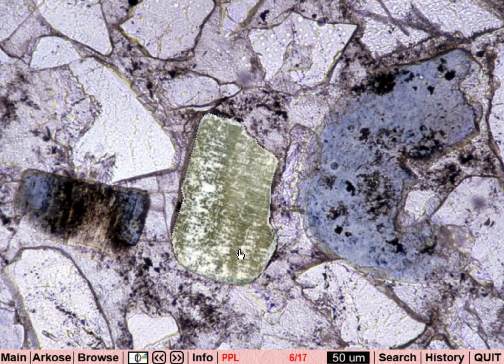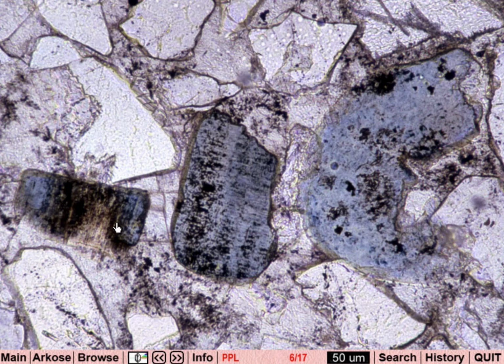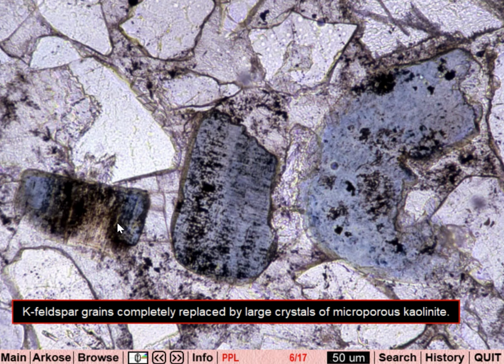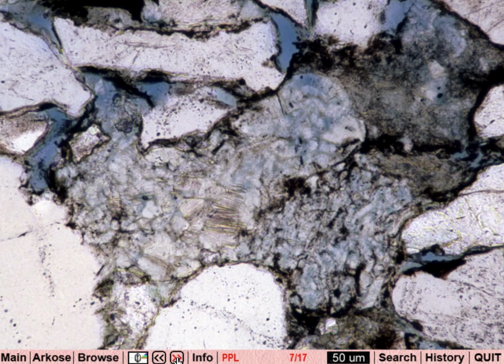Okay, here we are. Clearly plenty of quartz, but we're focusing here on potassium feldspar grains. But these feldspar grains have been totally replaced by the kaolinite. And notice how much black material there is in here. Keep in mind that potassium feldspar can have about 0.3% iron dissolved into it, and so that iron is being liberated and turned into either an iron oxide or hydroxide.